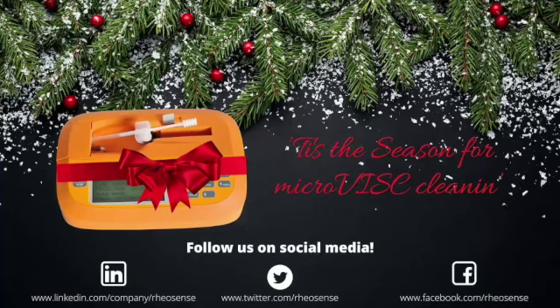So we're starting to get some questions rolling in. Oh, let's... Our live question and answer session. So the question is, are there any specific solvents that won't work with the viscometer or chip? So Zach let us know that we have a question. I'm not sure how well you can hear him, but he relayed the question: are there any specific solvents that won't work with the microVISC or chip?